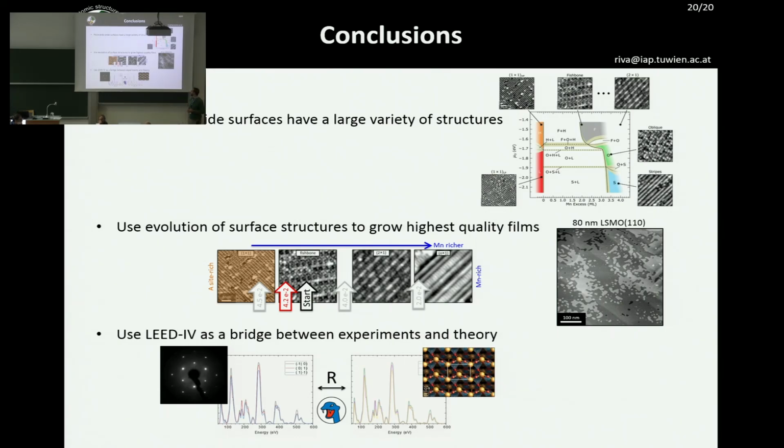I think there is enough information. In practice, the amount of information that you have in these data is the number of peaks that you see here, and there's a lot of information if you can acquire a large enough energy range. So I think we can tackle also pretty complicated periodic structures. Thank you.